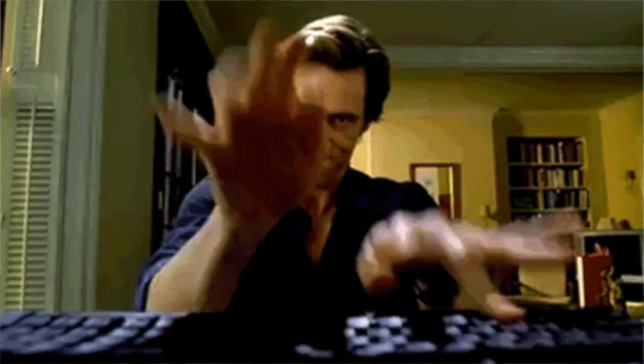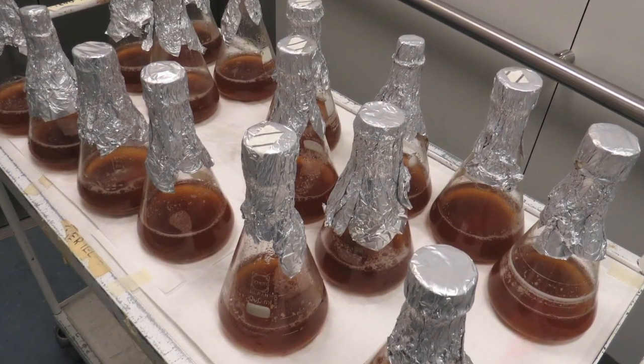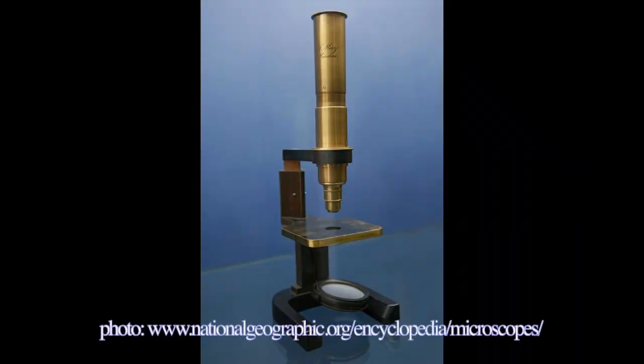Remember that there are applications and software that do it automatically, but to be honest, in some cases that requires a lot of preparation, requires very good pictures. Sometimes it's actually more work, so I prefer to do it manually because I have too many different strains and replicates. So just imagine that you have to prepare picture by picture, and sometimes you don't have a microscope with a camera attached to it, right? So it's difficult to get the same picture always. Some software or some applications require some calibration, so the size of the spore and these kind of things, and that always changes. So think about that when you want to choose an app or automatic setup to do this.